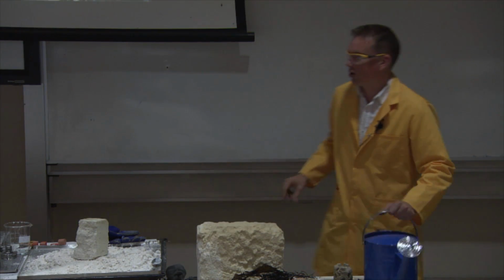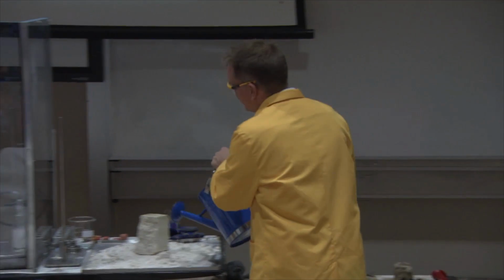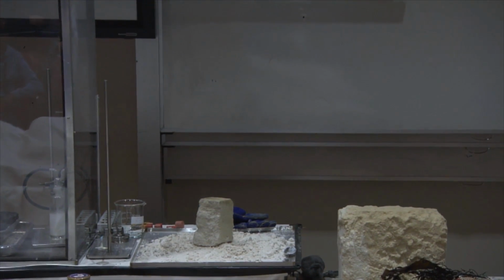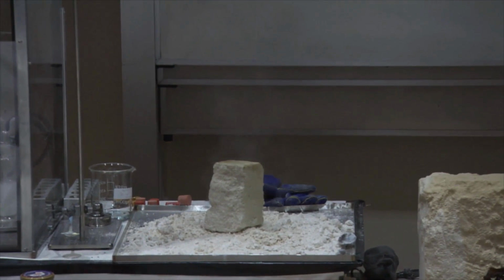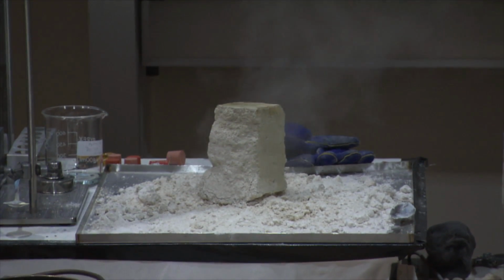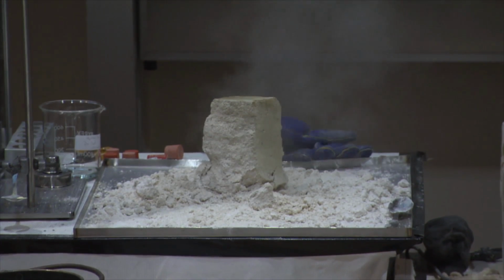But what about this rock? Well, let's see. I'm going to just pour some water onto this one and we'll see if anything happens here. So what have I got? Well, it looks like I've just got my wet rock again. Nothing very exciting has happened at all. But actually, look, something is happening. It seems to be smoking. Well, this is actually steam coming out. And this is because there's a very violent chemical reaction taking place here between the calcium oxide and the water.